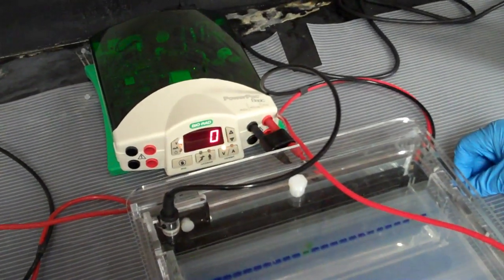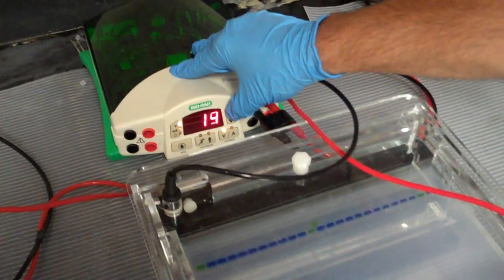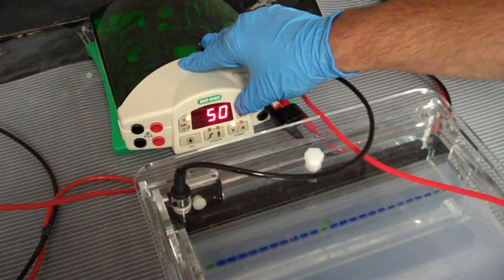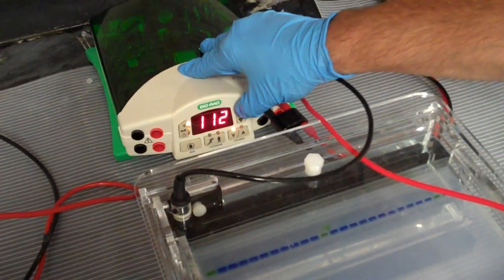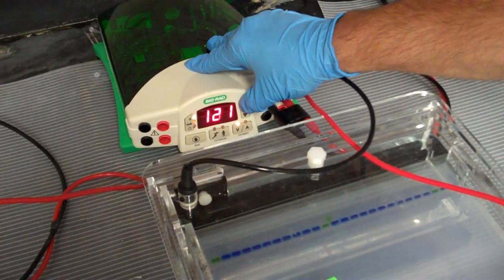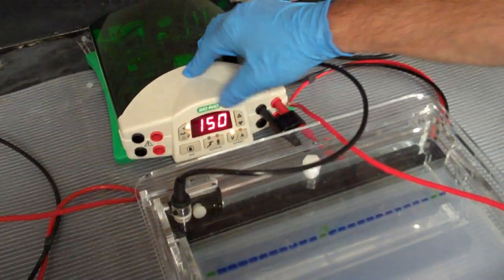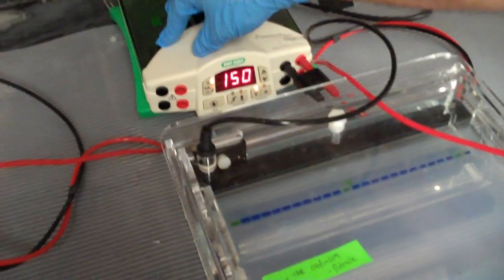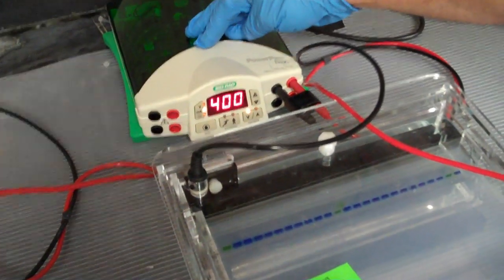Now adjust your voltage. Typically gels are run at 150 voltage. Now adjust your amps. Amps are always run at 400.